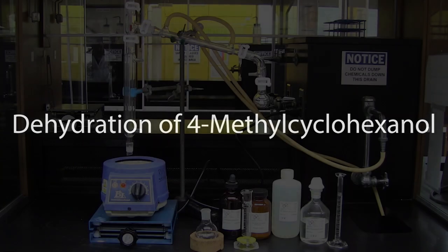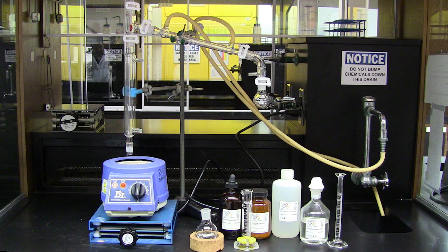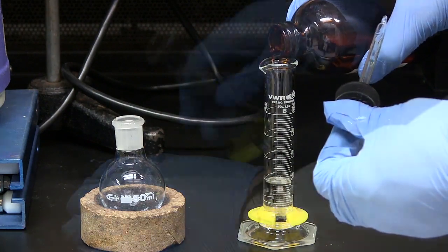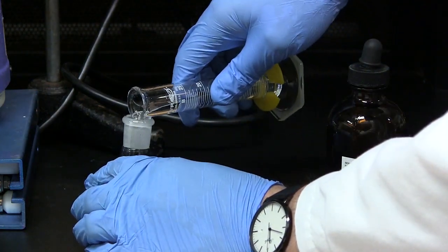In this experiment, we'll perform a dehydration of 4-methyl-cyclohexanol. Measure out 150 millimole of 4-methyl-cyclohexanol and add it to a 50 ml round-bottomed flask.